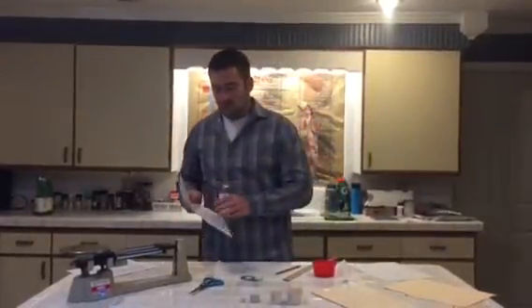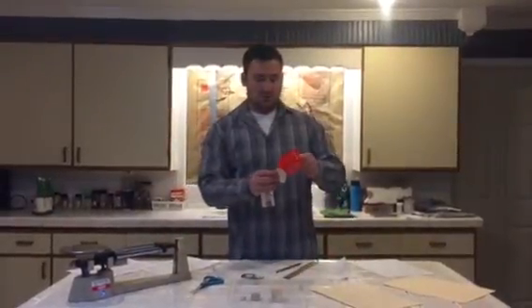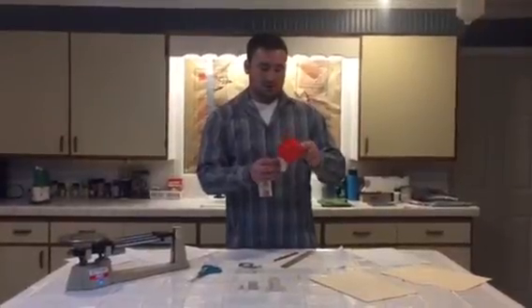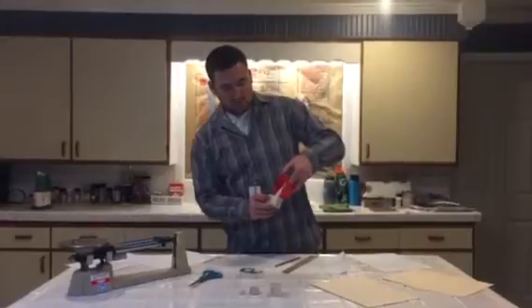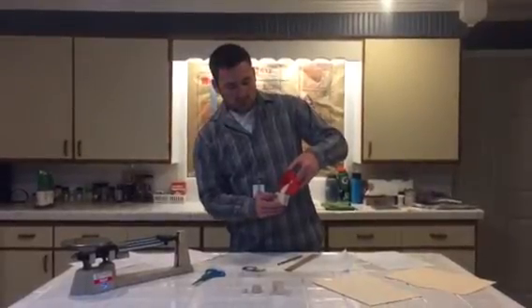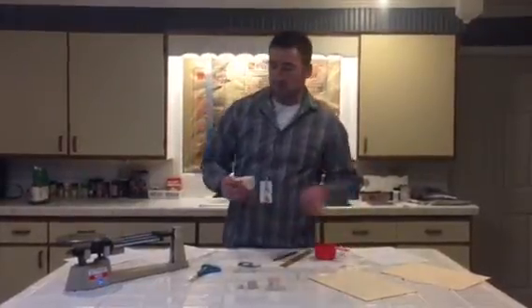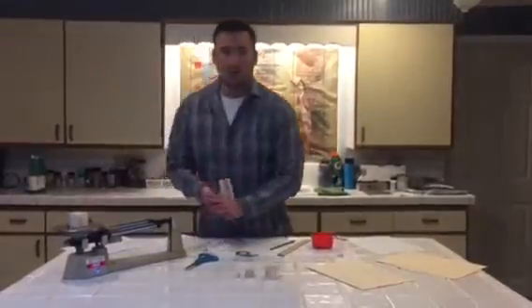So what we'll do then is take our sugar or sand, dump it in our cubes carefully, take it all the way to the rim, then we would set it on the scale. We've got to put that down. And then we would weigh it.